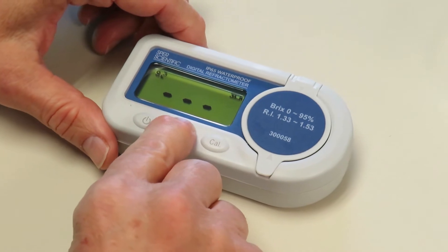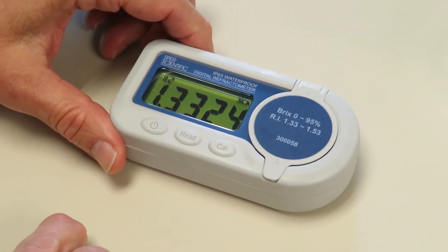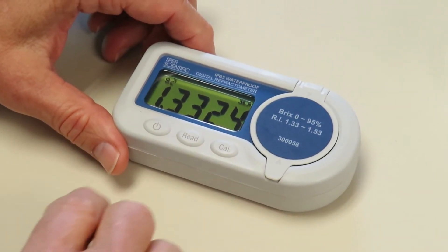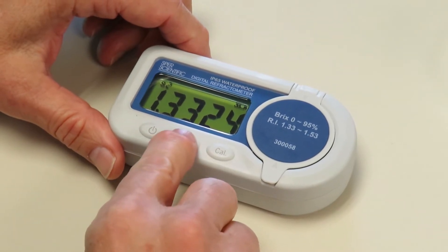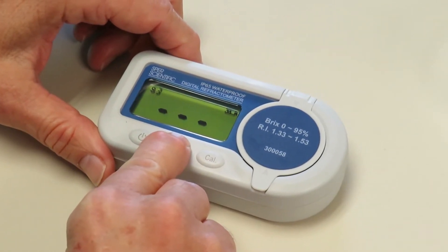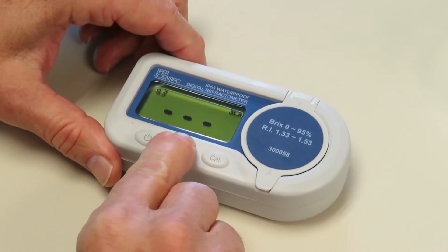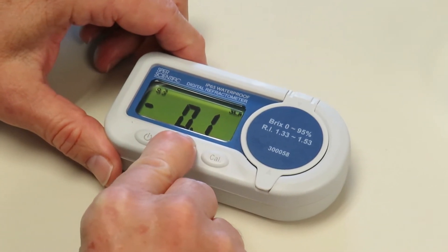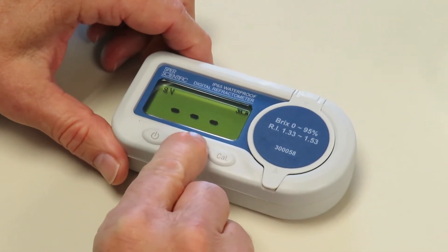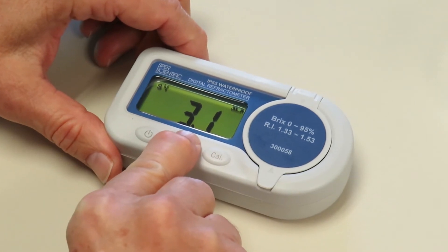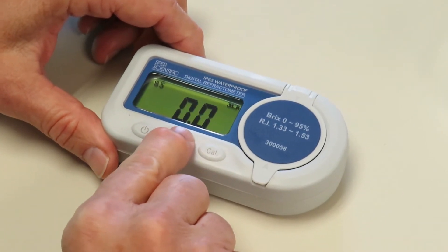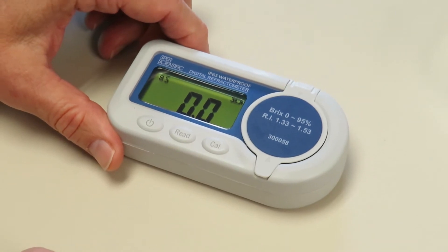If I now press Read, it's in a refractive index mode, and I can scroll through different modes. This unit has quite a few by holding the button down. So let's get back to the first mode, and here we can see that the reading is zero.